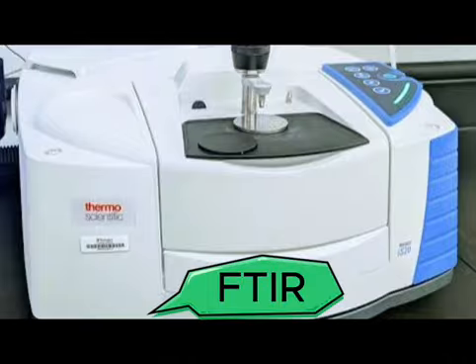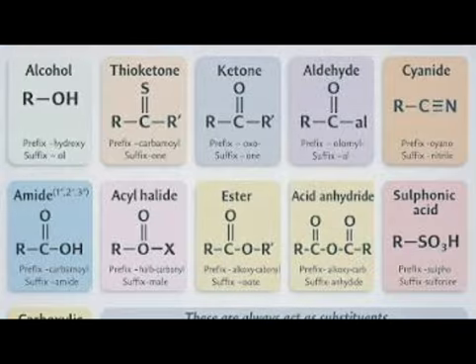The FTIR, Fourier Transform Infrared Spectroscopy. It gives us information about the functional groups and bonding nature.